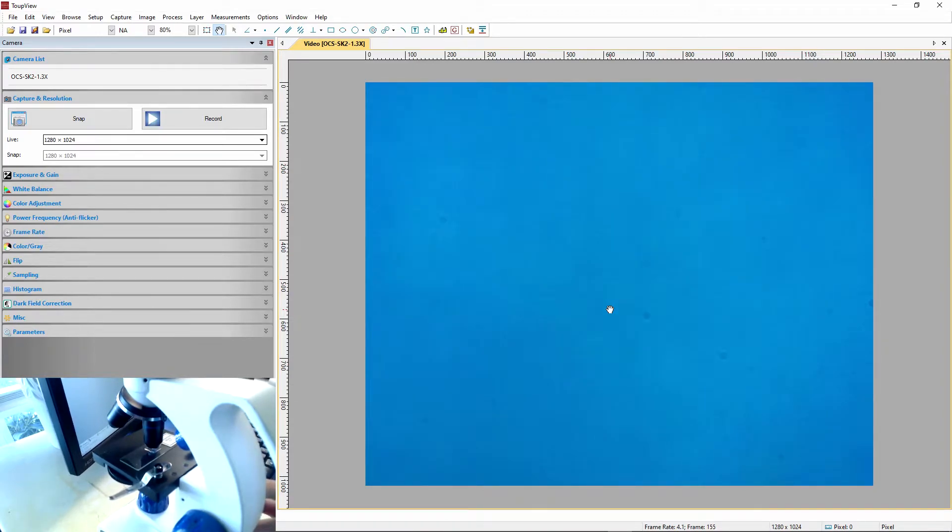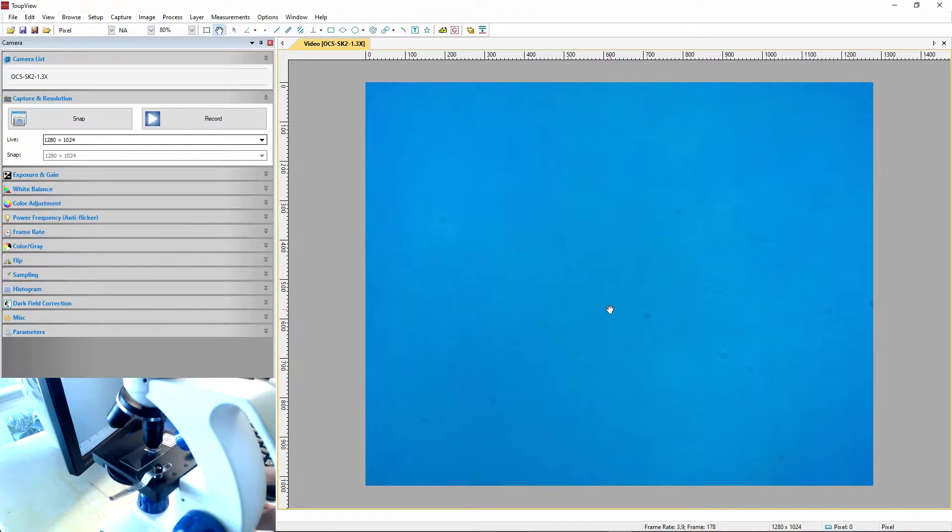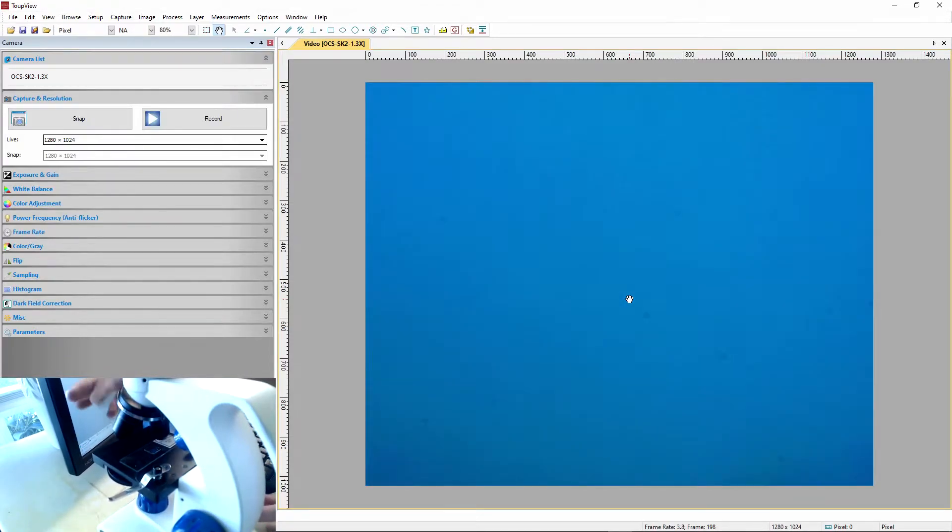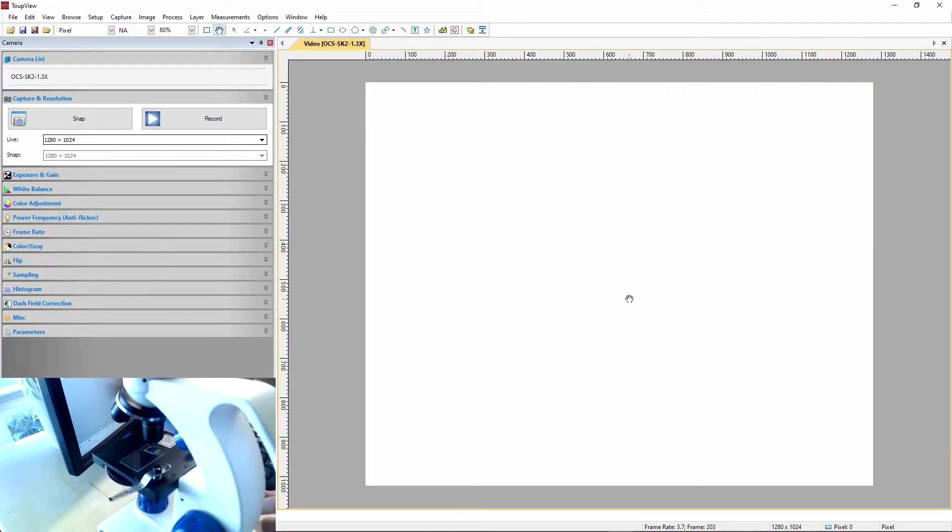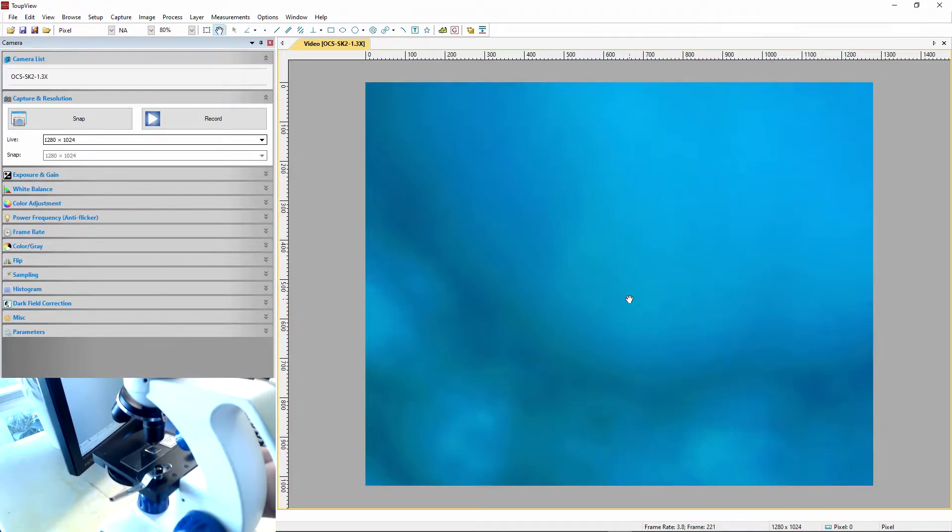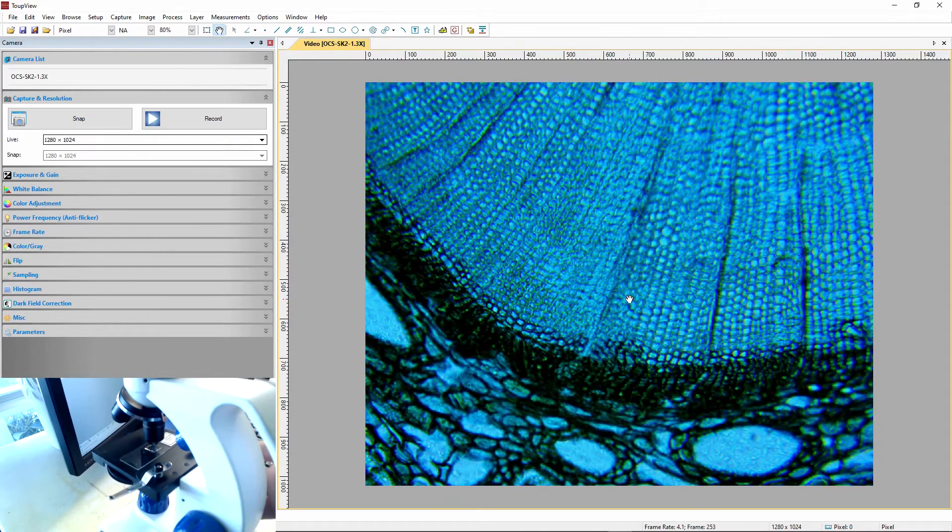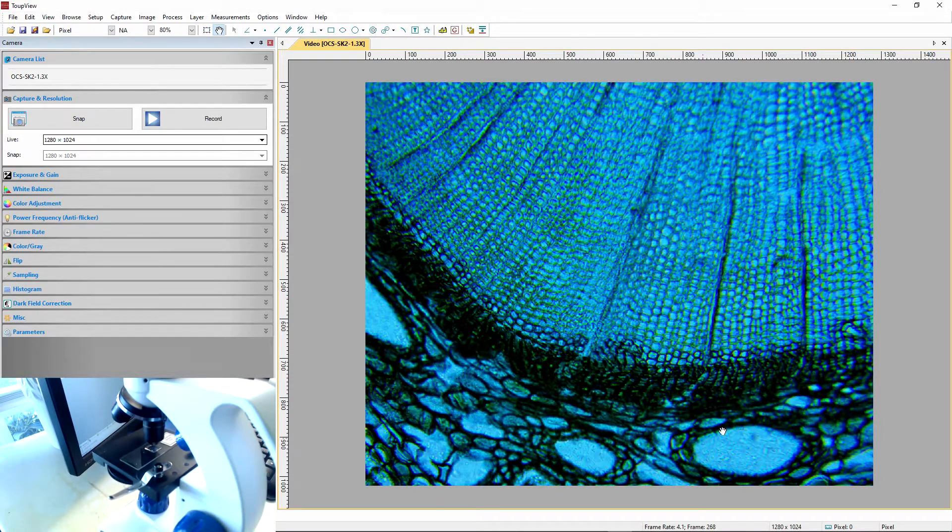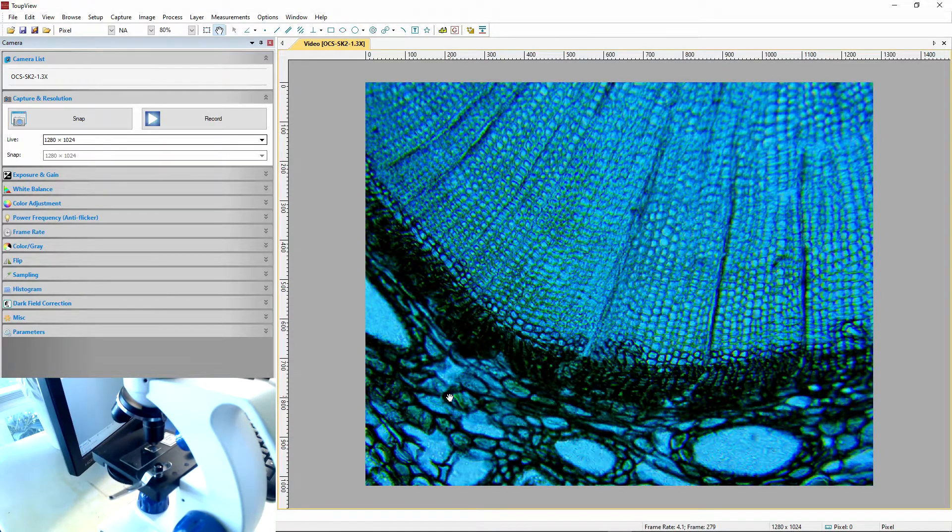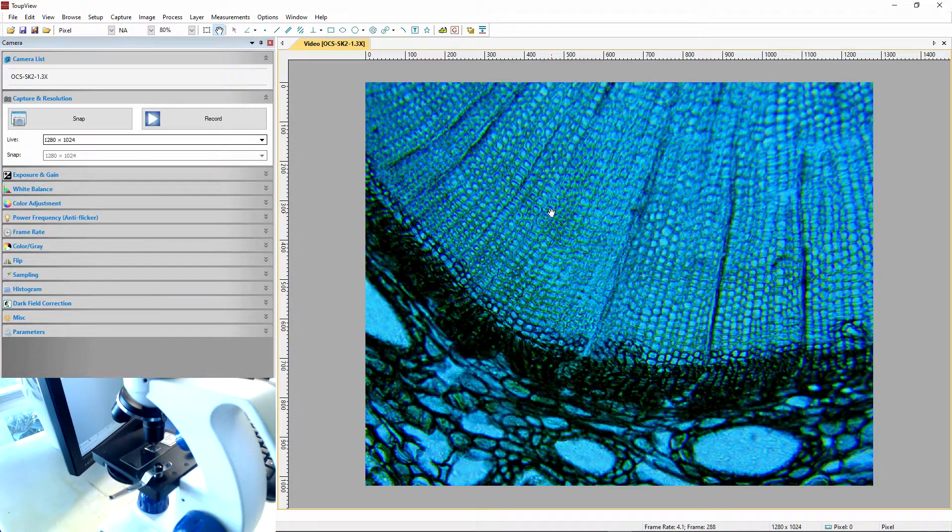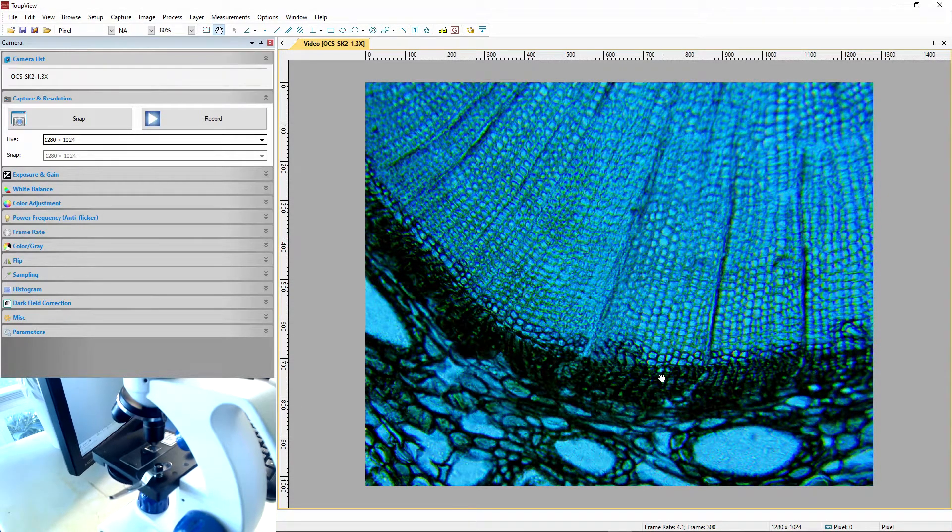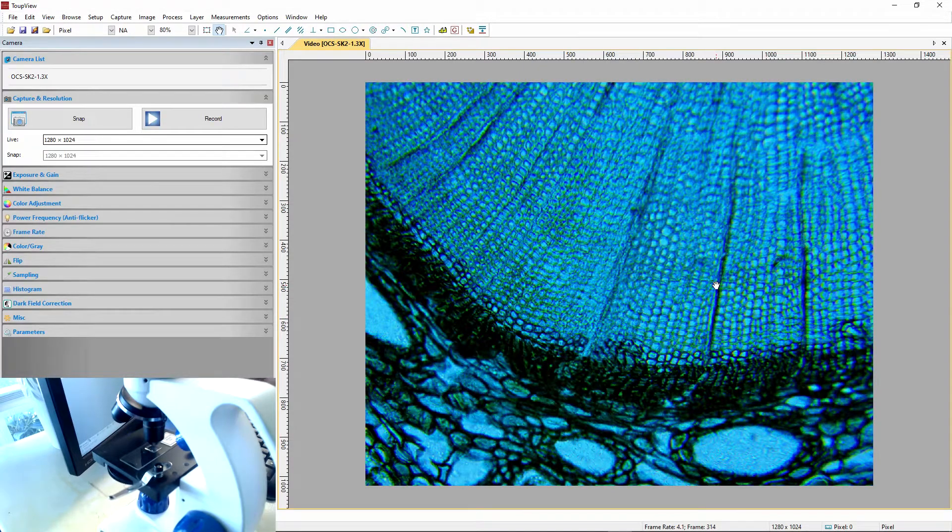Need to make sure, where is it? Okay. Did it count in focus? Okay, we'll do it a hundred times. Try that. There, now we go. So, I think what we're seeing, this is like the bark on the, it's like a tiny twig. A big cross section. So, this is the bark of the tree. And each one of these little dots is a cell. I think.